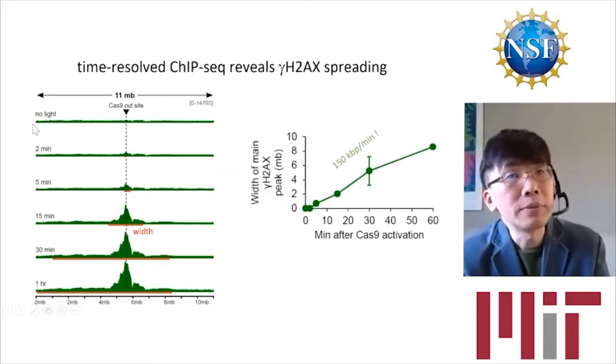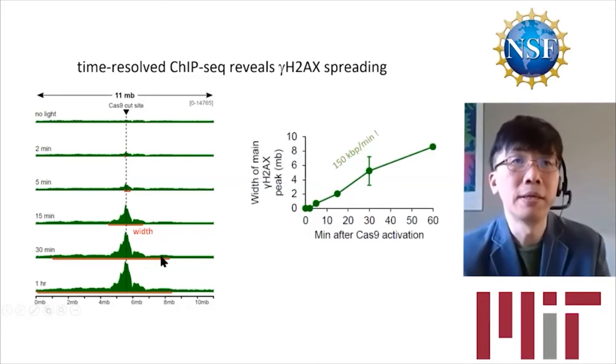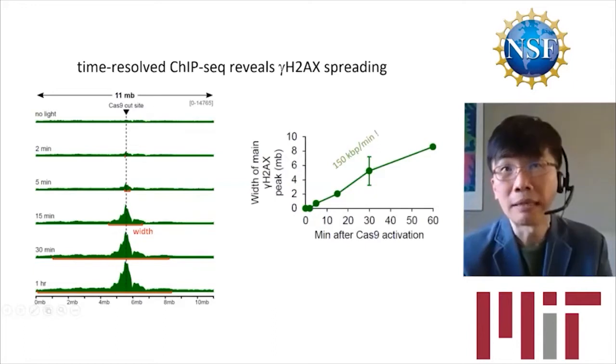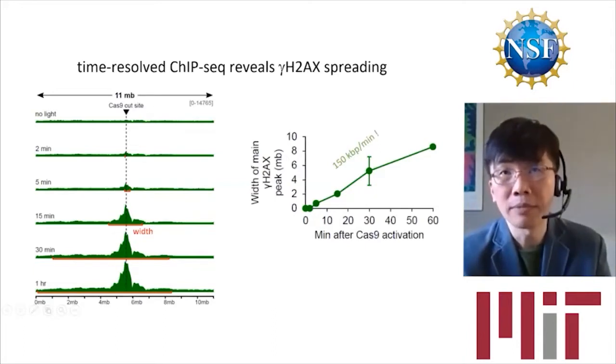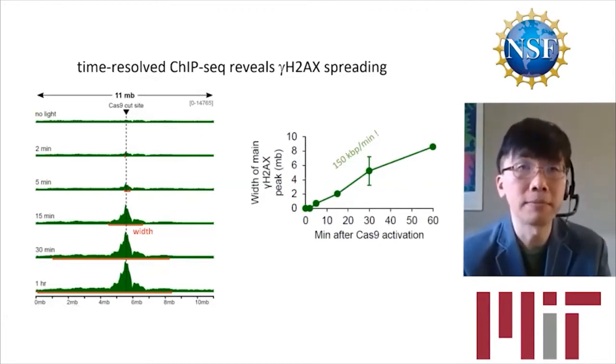This is an example data set. So you make a cut here. This 11 megabase pair region around the cut site. No light, just background. 2 minutes after light, we see a tiny bump here above the background. Then this becomes taller and wider at 5 minutes, even wider at 15 minutes, wider yet at 30 minutes and 1 hour. So you can actually measure the width as a function of time and show that the width increases linearly in time with a speed of approximately 150 kilobase pairs per minute, which to me was amazingly fast.